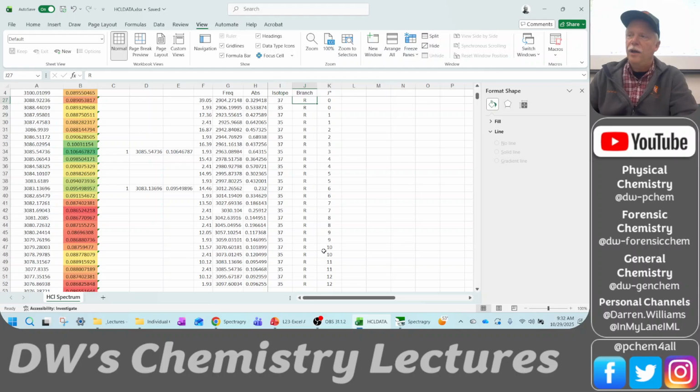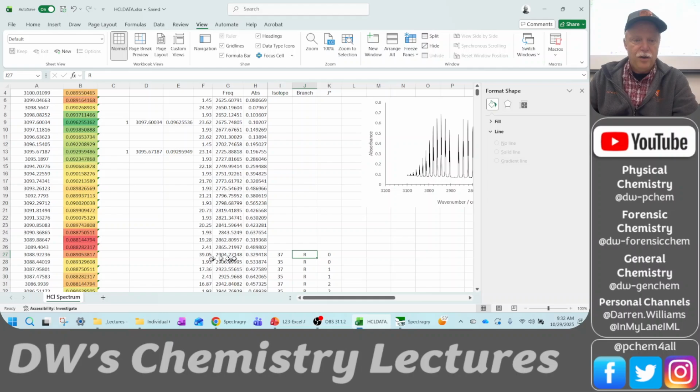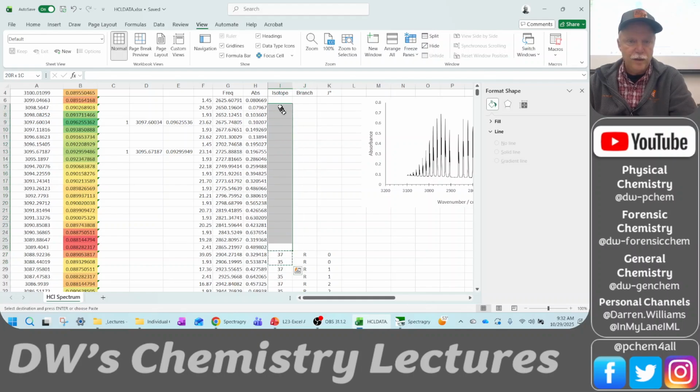So there I've done the R branch. Now we go across that 39 wave number gap and we get into the P branch. Again, still the 48 would be the 35 isotope, and the 31 here would be the 37. So we're going to go ahead and copy those up.